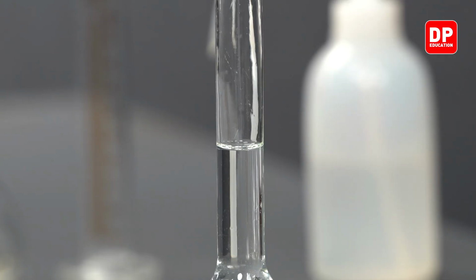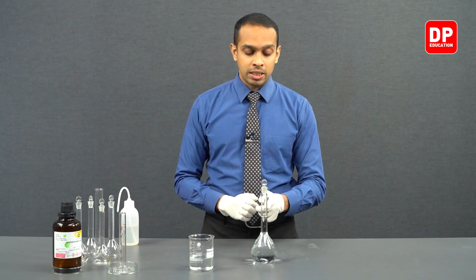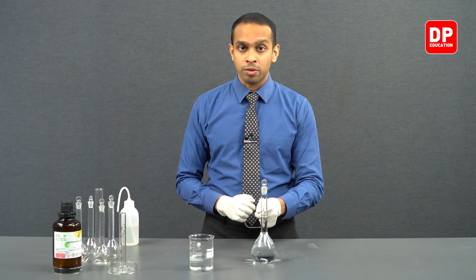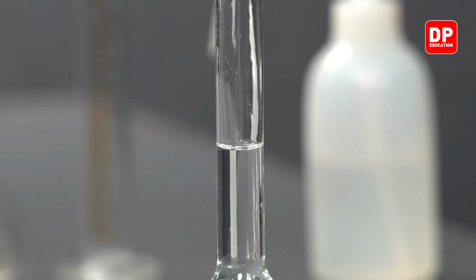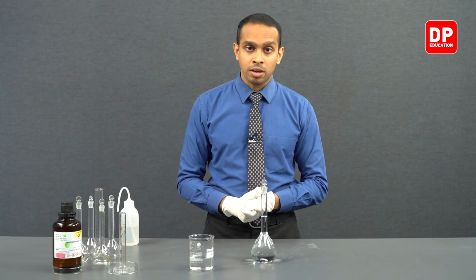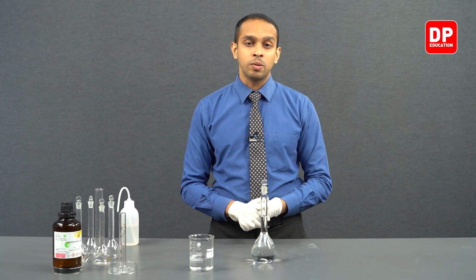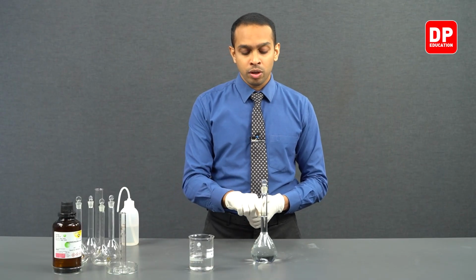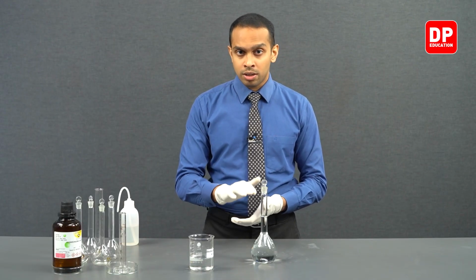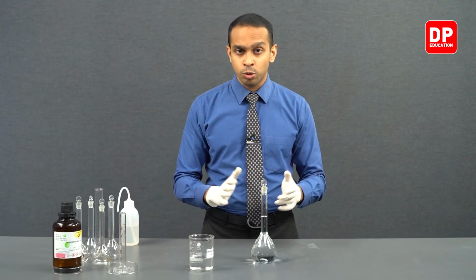So after adding water up to the correct mark, you can place the stopper and start mixing the solution. Now students, we have added exactly the right amount of water, and as you can see over here, the bottommost part of the meniscus is aligning really well with the calibration mark. The bottom of the meniscus should align with the calibration mark when you're producing a solution like this. So when you're adding water, you have to be very careful not to add too much water, because if you add even a few drops more, the bottom of the meniscus will not align with the calibration mark. So at that point, you might have added too much water and you will have to start over.